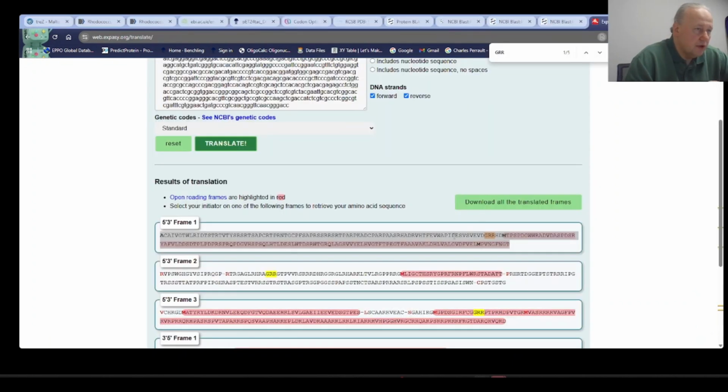The issue, however, is that if we go from here, we quickly pass 16 residues and we don't get a methionine, and the sequence just runs on. So is it a possibility that the sequence is super long, or that a sequencing error has happened, and the assembler just didn't know how to call it? So the annotation engine picked the nearest residue that could have been a methionine. This V changed one nucleotide, or pretended that GTG is also okay to start with, which in some bacteria sometimes it is, and called it a day.